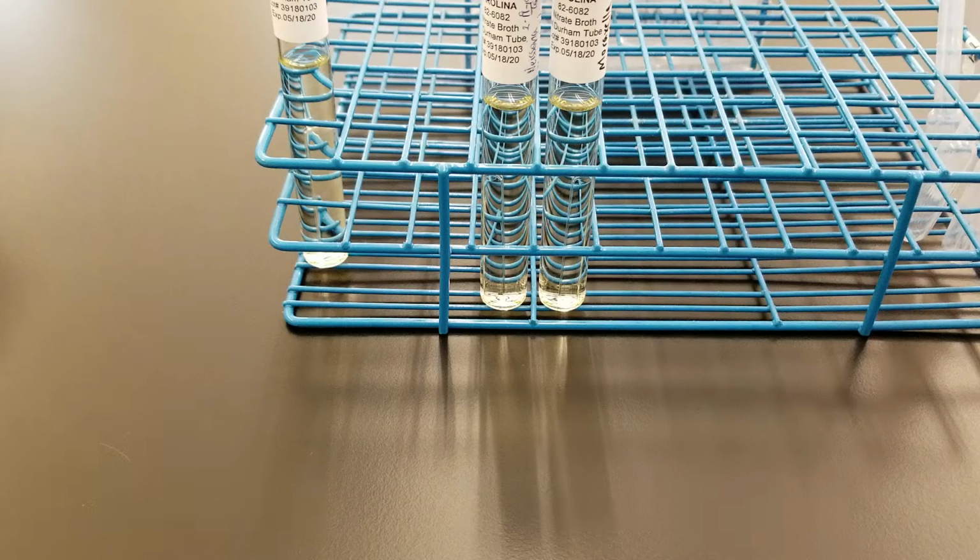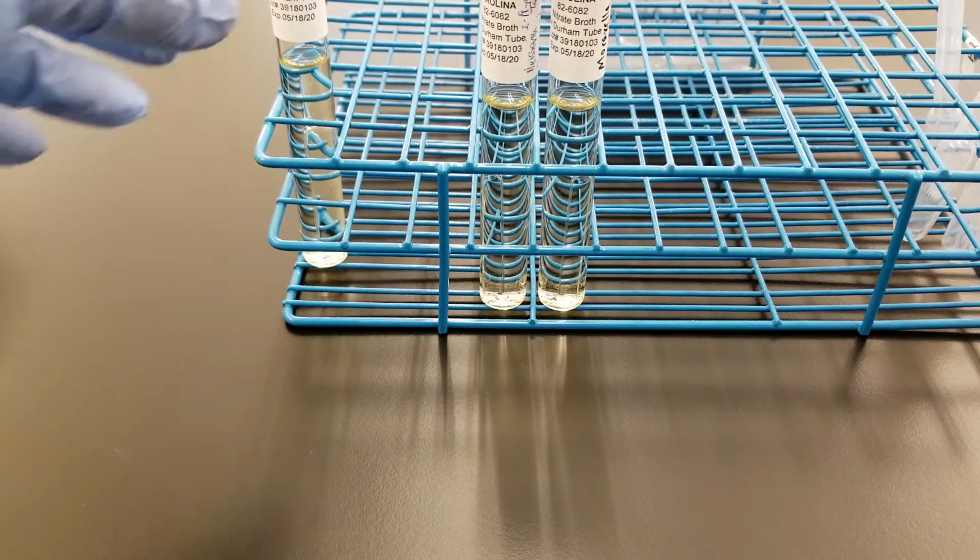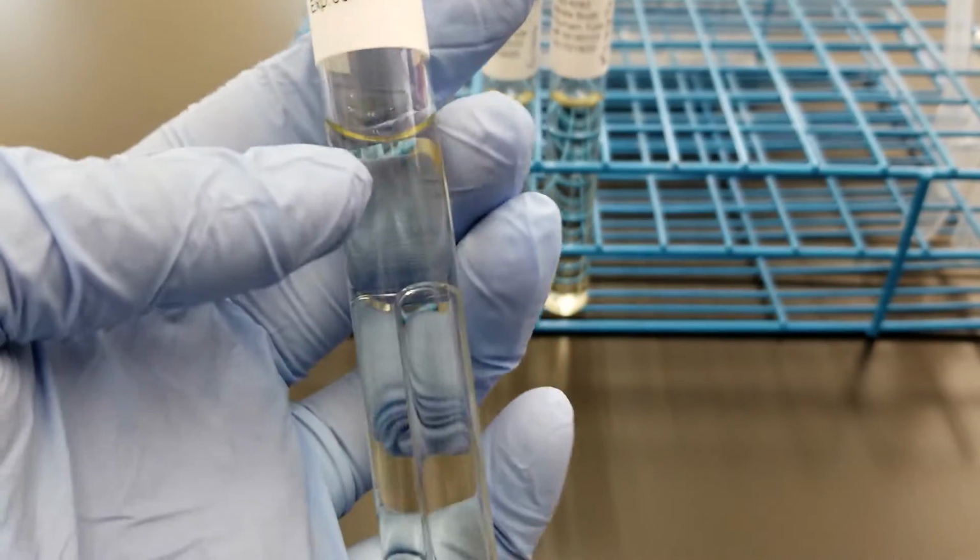Hello everyone, today we're doing the nitrate reduction test. This test is done on gram-negative organisms that use nitrate as the final electron receptor instead of atmospheric oxygen in the cellular respiration process. What we're looking for is basically, this is a nitrate broth tube.